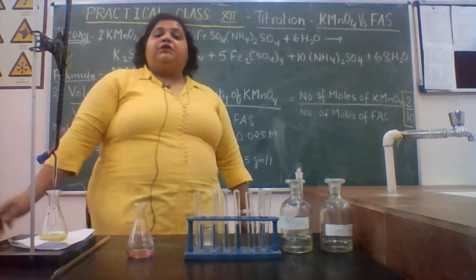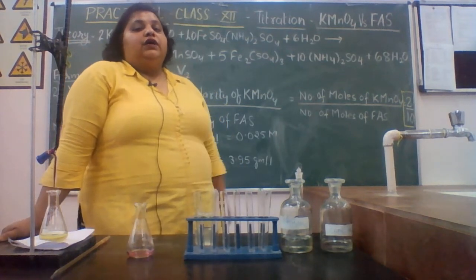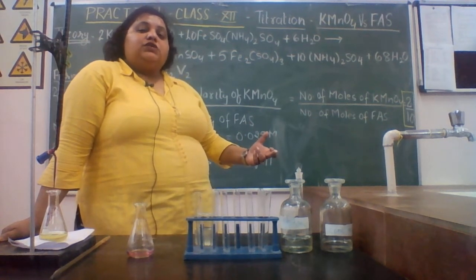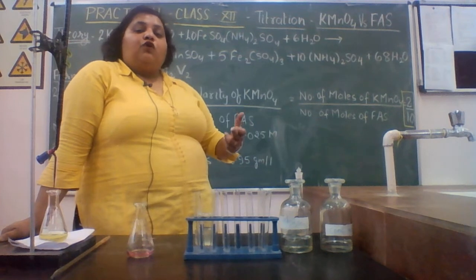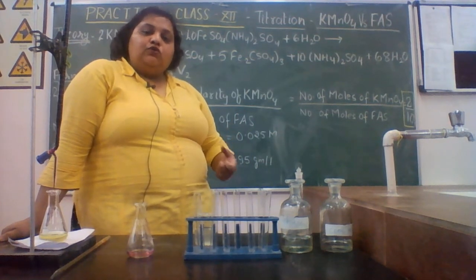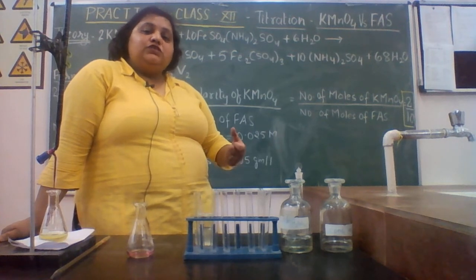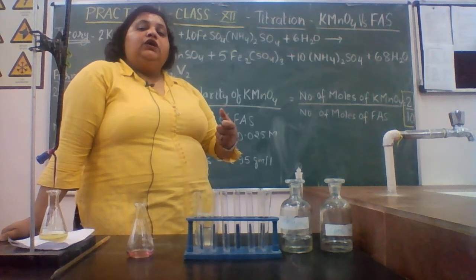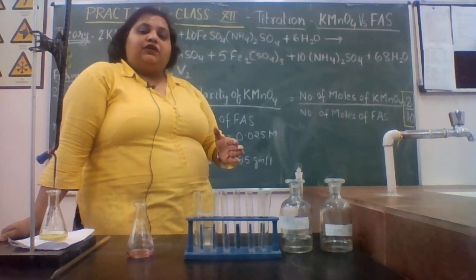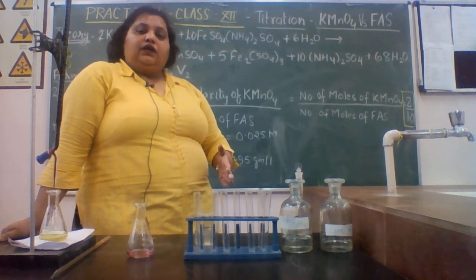Repeat the experiment, note the reading, and by minor calculation, just final volume minus initial volume, find out the volume of the KMnO4 that you have used. As you get 3 similar volumes, stop, your experiment is complete, right.